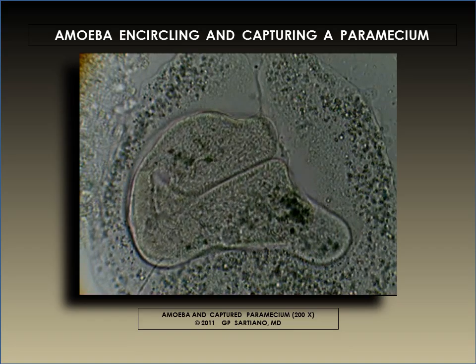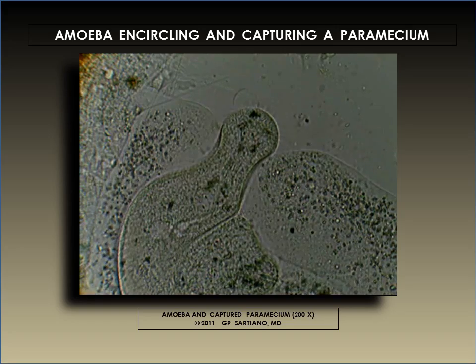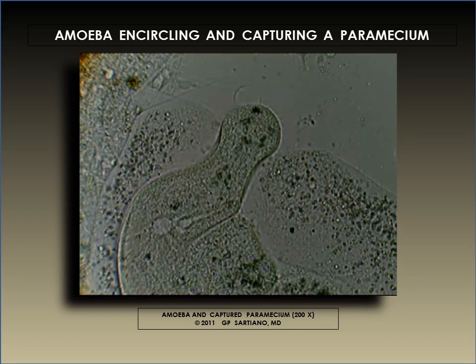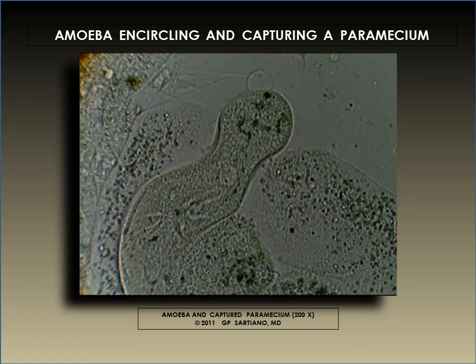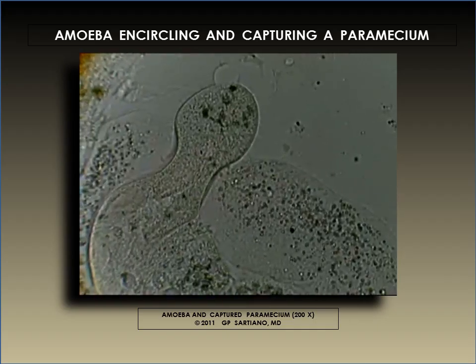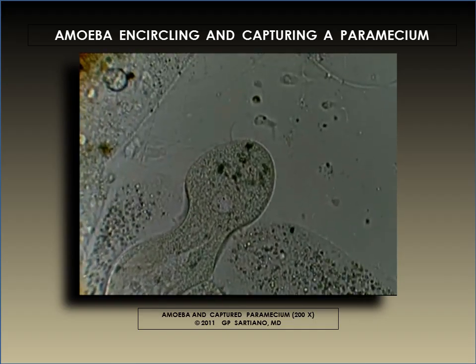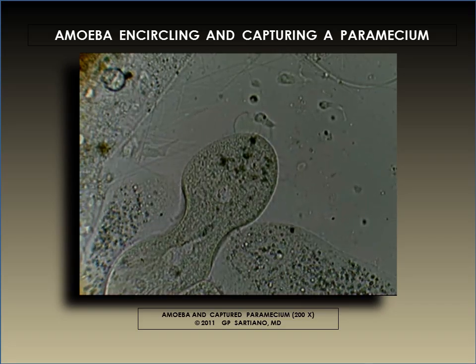Perhaps the amoeba had no taste for the paramecium, or perhaps it had tired of the fray. For whatever reason, the gap in its trap-like circle has opened, allowing the paramecium to escape.